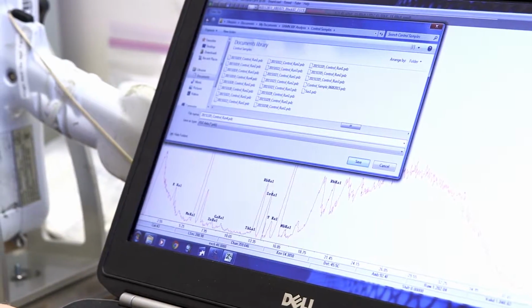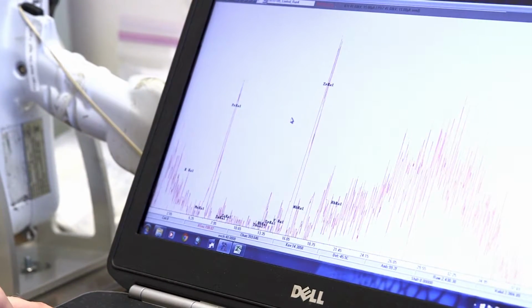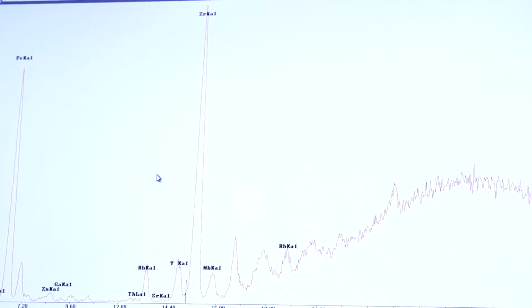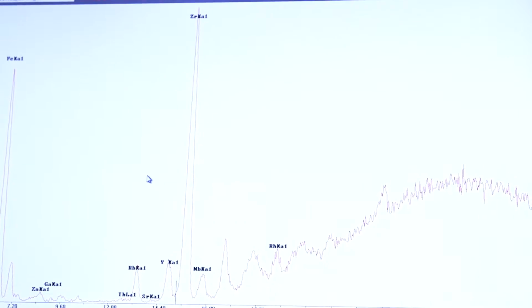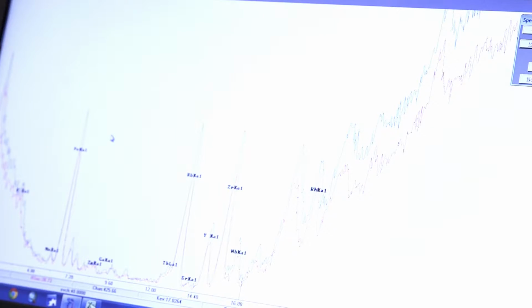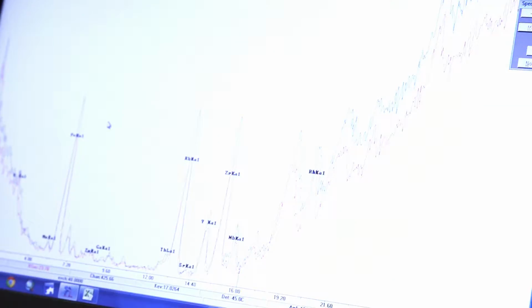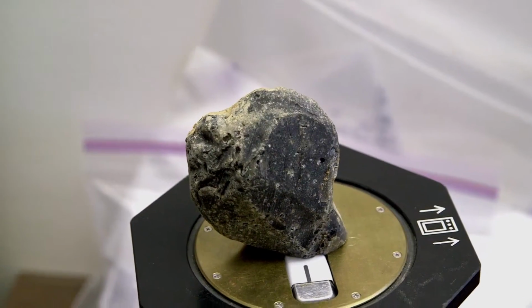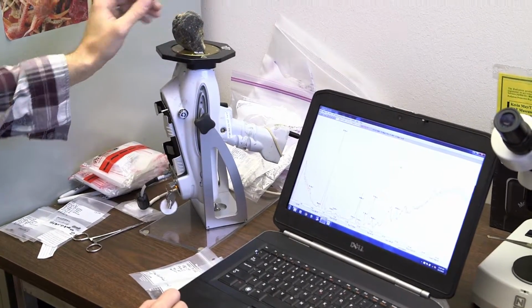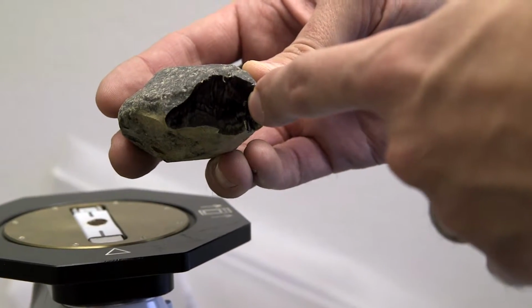The software shows concentrations of elements that are being detected in a material by the height of the peak within a spectrum. You can see here that the relative abundance of an element in a material is represented by taller and shorter peaks of the spectrum. In the case of volcanic rocks, we have been able to calibrate the software to track the abundance of elements in parts per million. Here's an obsidian nodule that's from gravels around Wrangell St. Elias. We call this the Wiki Peak source. Our obsidian flake from Quartz Lake sources to this area.